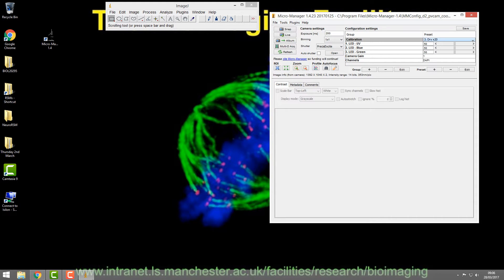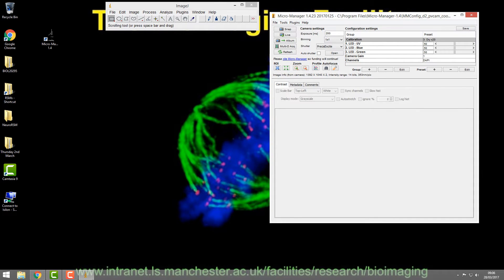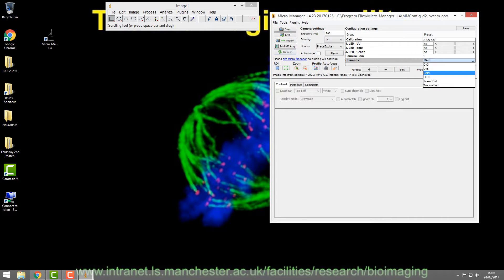We're on the 20x at the moment, so this is linked to the 20x. If you change to 10x by just twisting the nosepiece, you then have to tell the software you're using the 10x. If you get it wrong, your calibrations will be wrong. You can correct that in ImageJ later, but mainly this is how you control it via the Channels tab.